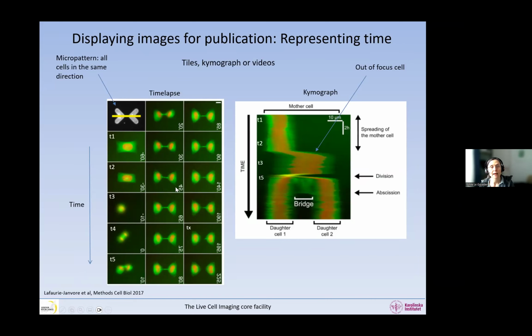And this cell is sort of held into place in one way or another. So it's sort of attached, so forced into this shape. And so if we have a line in each of these images, we can then follow and only get the intensity along this line. So you can see that if I draw a line here, I'm going to be in the background, and suddenly I get some green, and here I get likely a bit of green and also some orange, and then I go into the green, and then I go into the background.